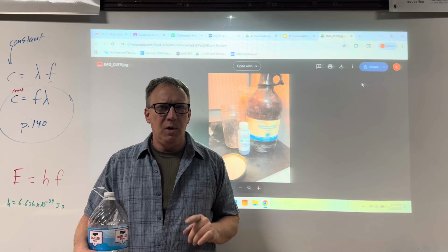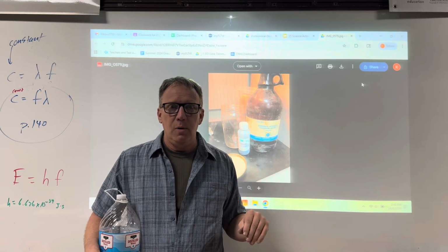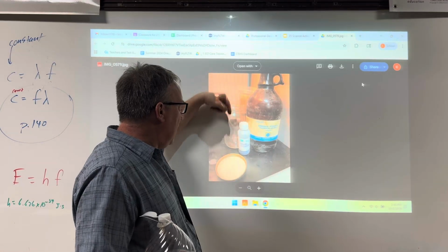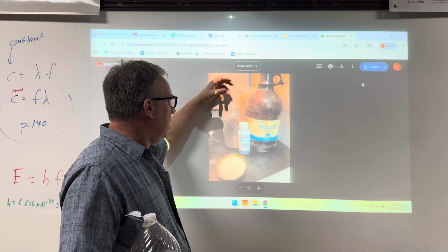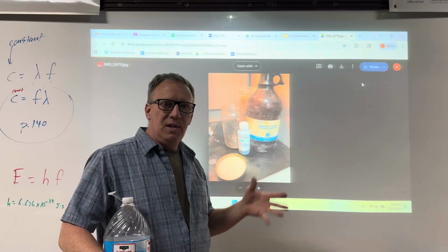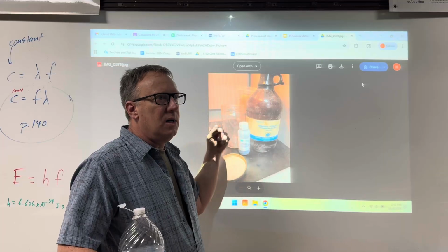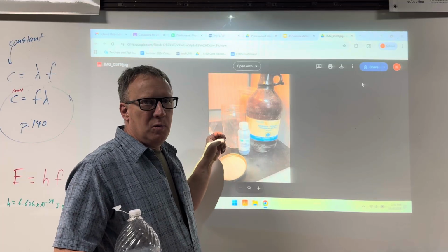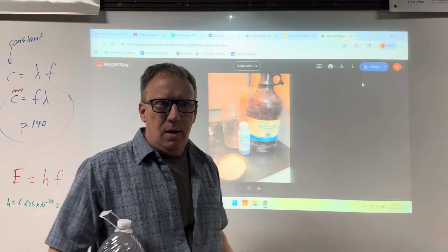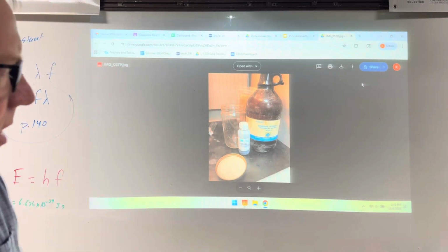Okay, let me talk about something else, litmus. There's not blue litmus paper and red litmus paper, there's just litmus paper. You can put a vial of litmus paper in here with the lid open and put it in there with ammonia and close it up, and it will turn blue within seconds. It will restore it. You can put another container like this with concentrated hydrochloric acid in it, straight out of the reagent bottle where it'll make vapor, and put a lid on it, and that'll turn it red. So you can reset your litmus too. There's not two different kinds of litmus. Nobody ever tells you that. You'll figure it out on your own.